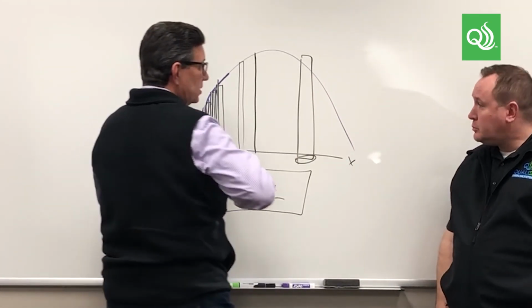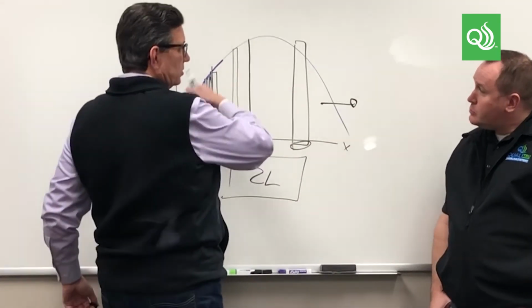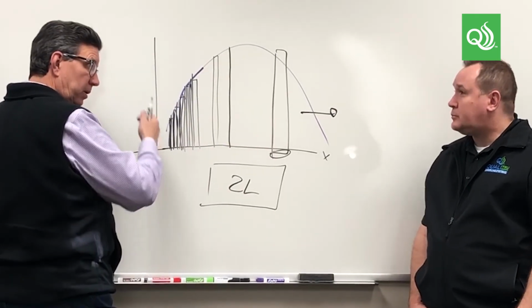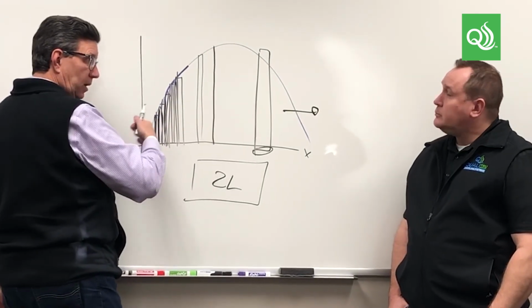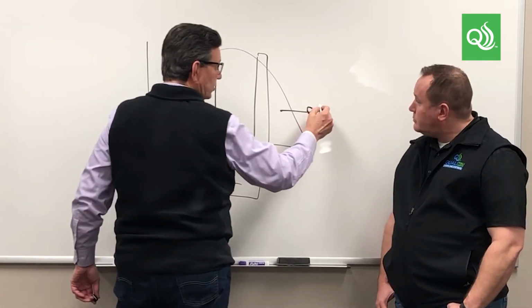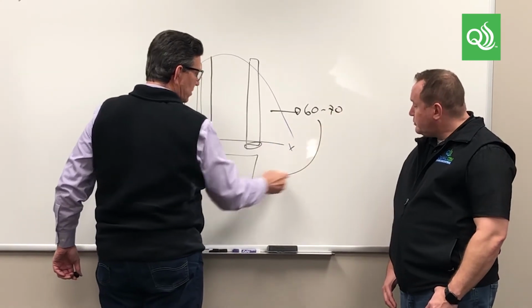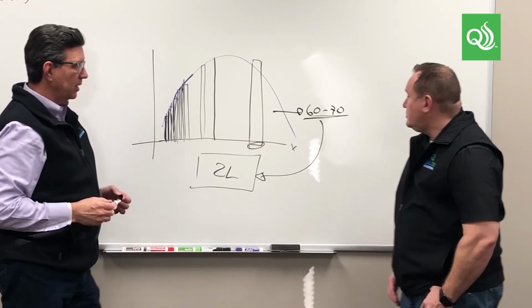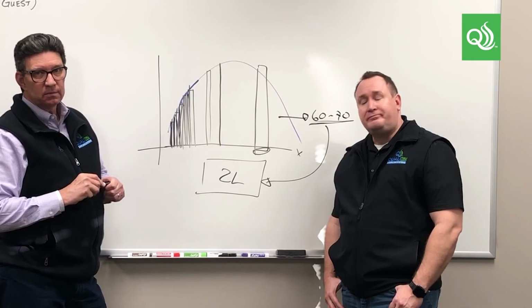Right. So let's say this milk was going onto a large truck, and I milked multiple pens throughout this 12-hour period in between my clean in place cycles, in between CIP, and I was taking a sample of all that milk that was going on the truck. So now I've got a truck out here with what, 60 to 70,000 pounds of milk on it. Sure. This 2-liter bag looks exactly like that 70,000 pounds of milk on a truck. And that's what farmers get paid on, that's what our producers get paid on.